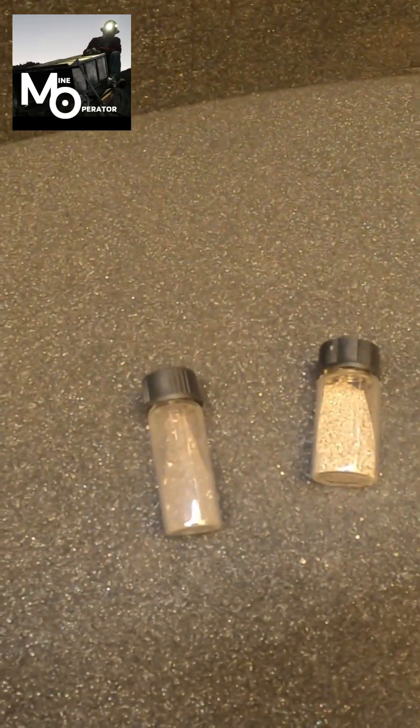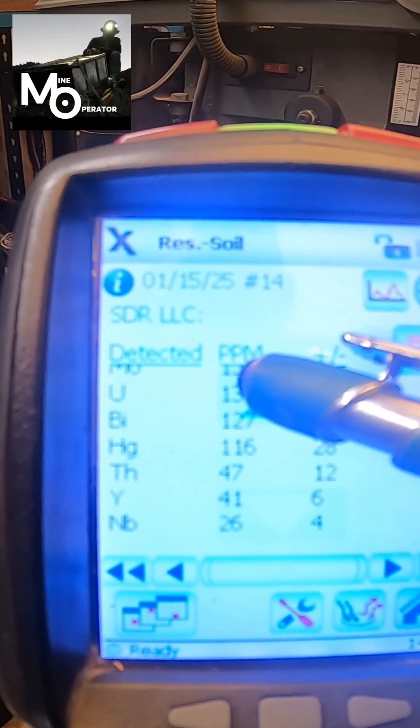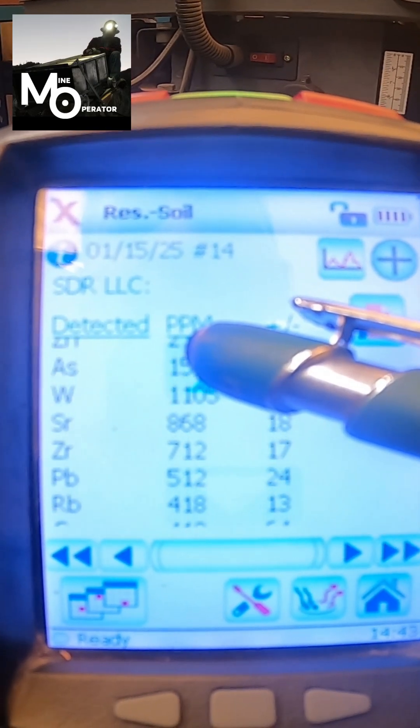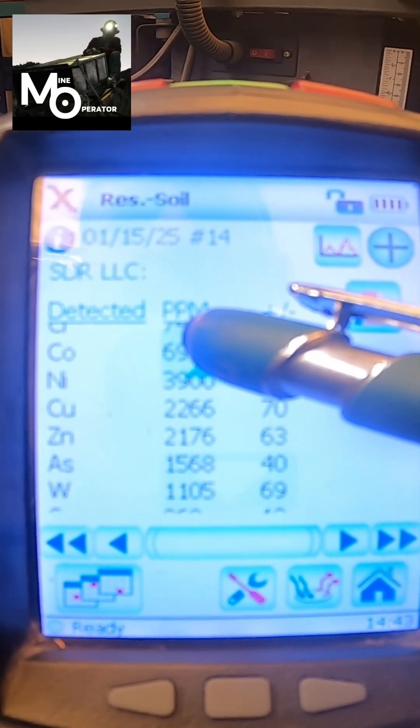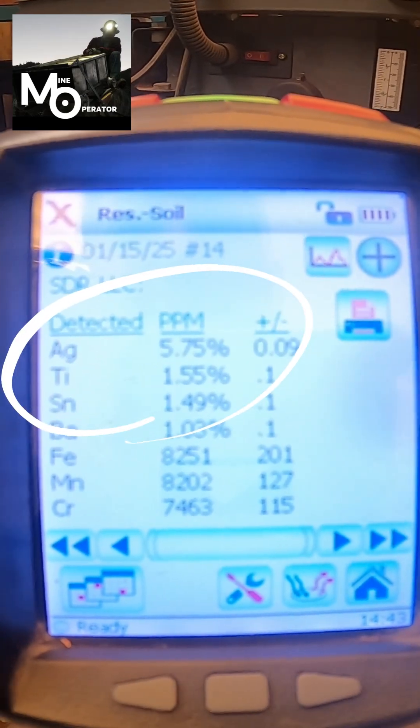Sean, we encourage you to get this sample tested and verified by an ISO accredited lab. In soils mode, it did identify 5.75% silver. However, soils mode will not identify gold or the platinum group elements.